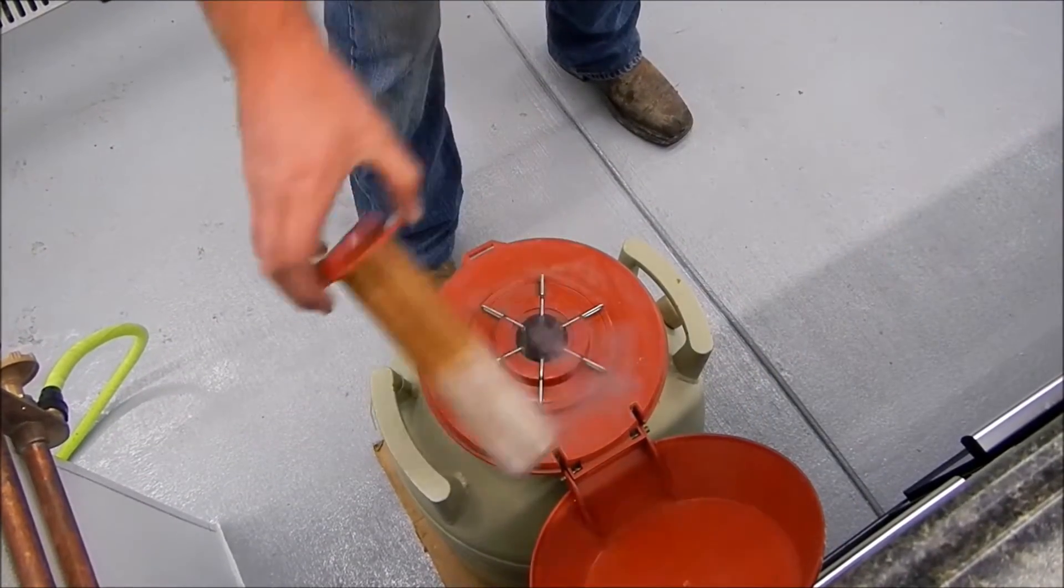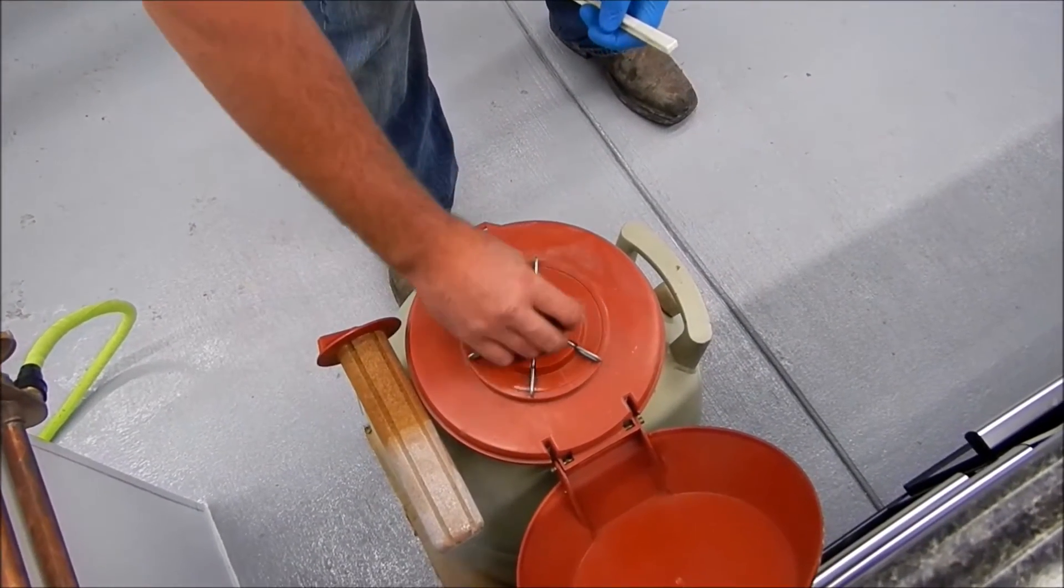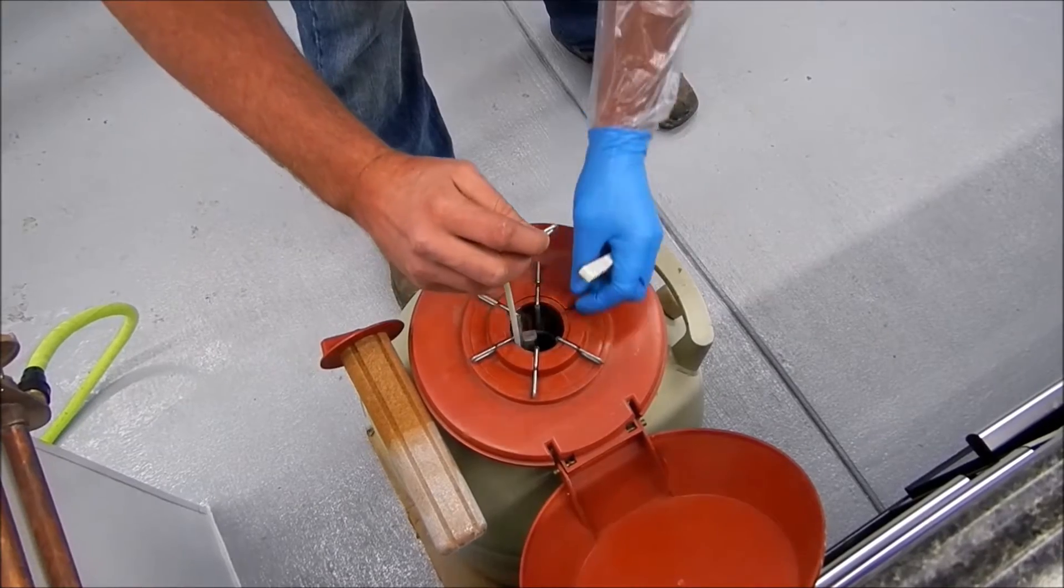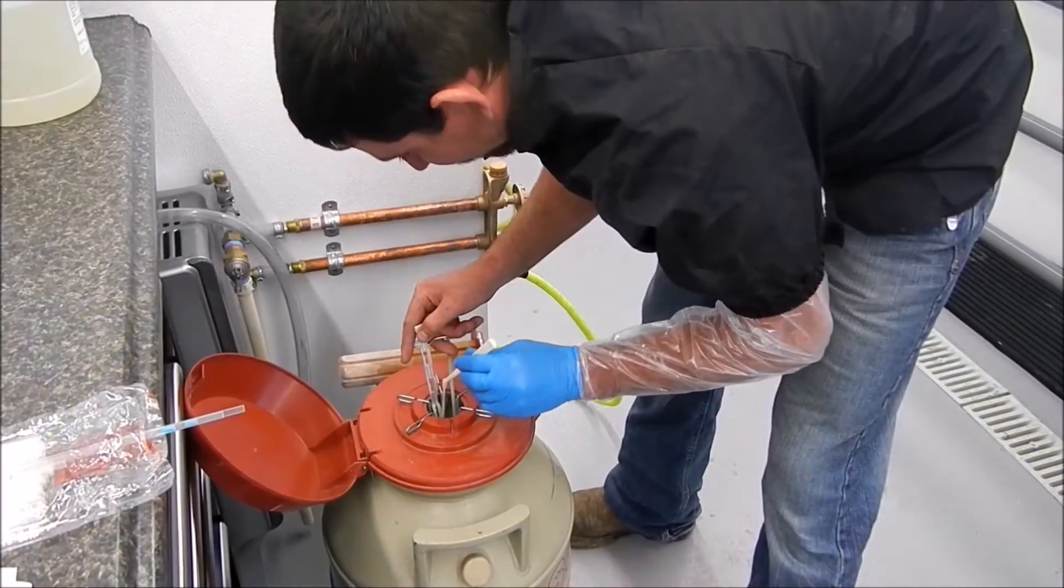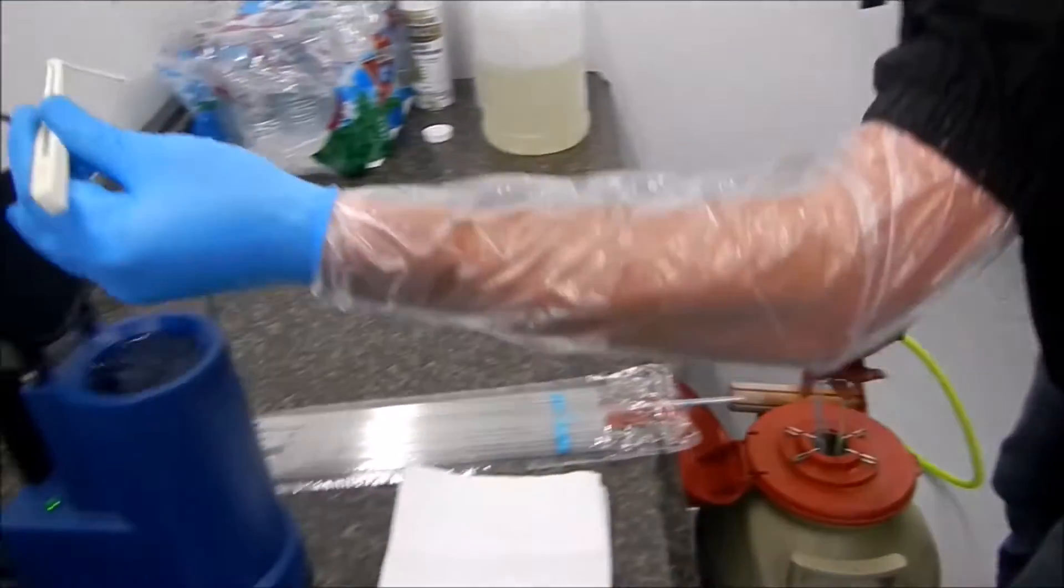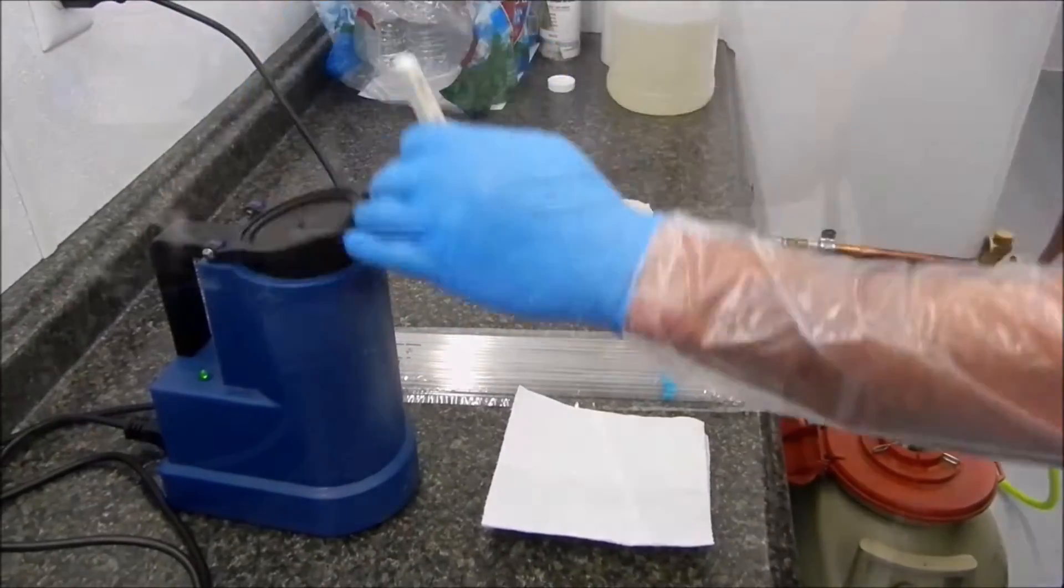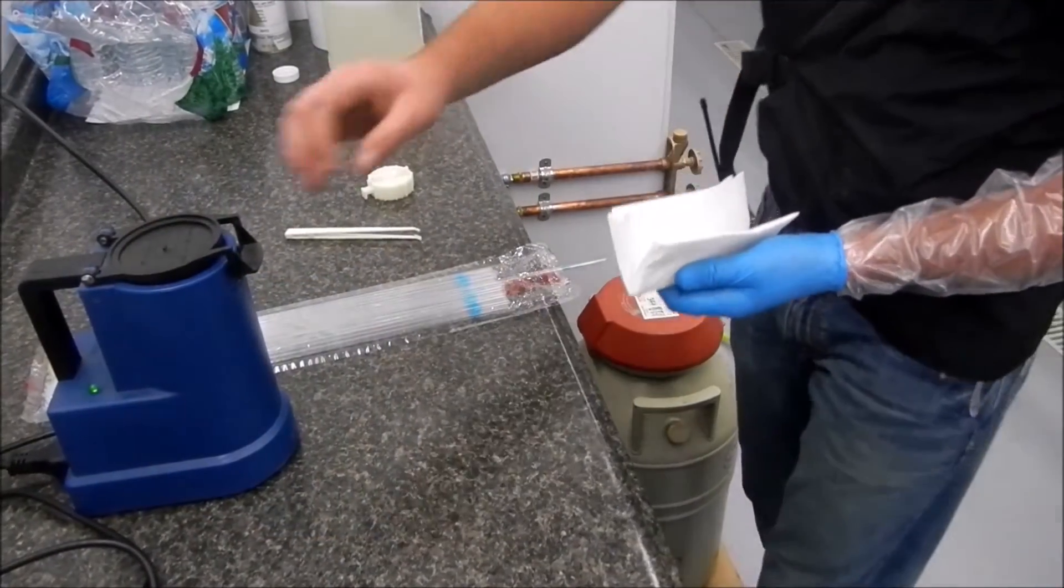The first step in an AI procedure is to remove the semen straw from the liquid nitrogen tank. This must be done quickly and then inserted into the water bath, which is set at 96 degrees. At this point, we'll thaw the semen for approximately 30 to 45 seconds.